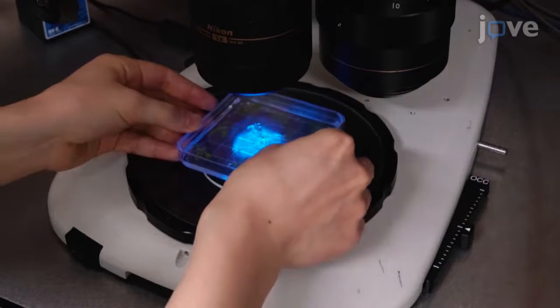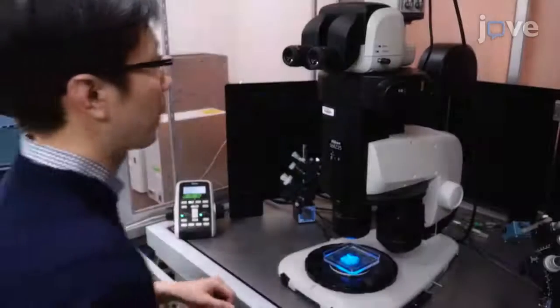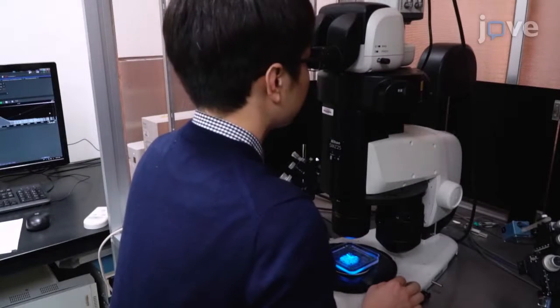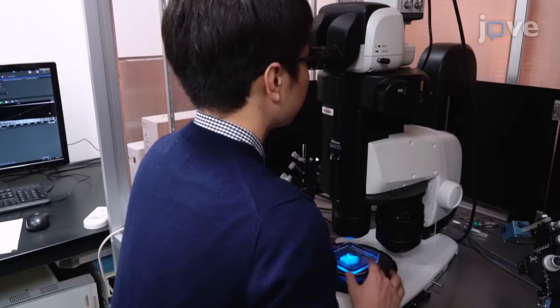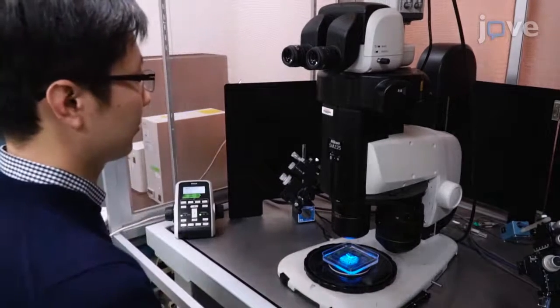Remove the lid from the dish containing the plant and place it under the objective lens. Check the fluorescence signal from the plant. Then wait for approximately 30 minutes in the dark until the plants are adapted to the new environmental conditions.